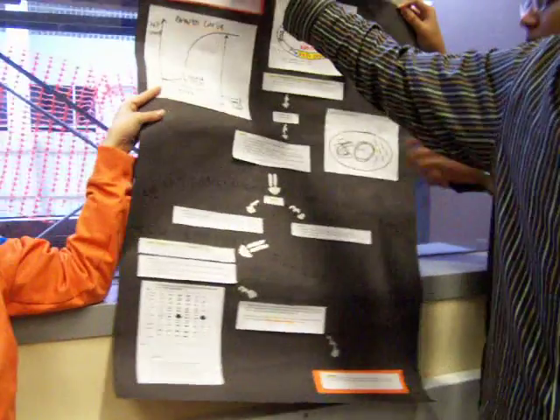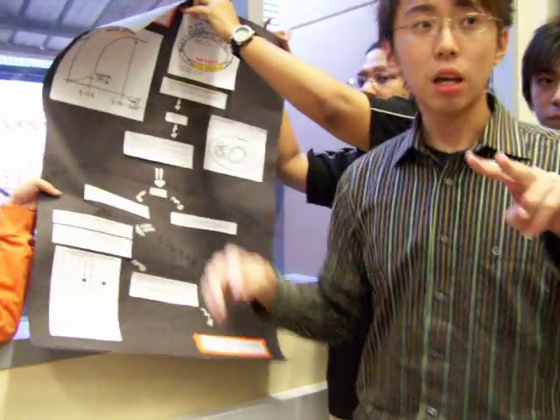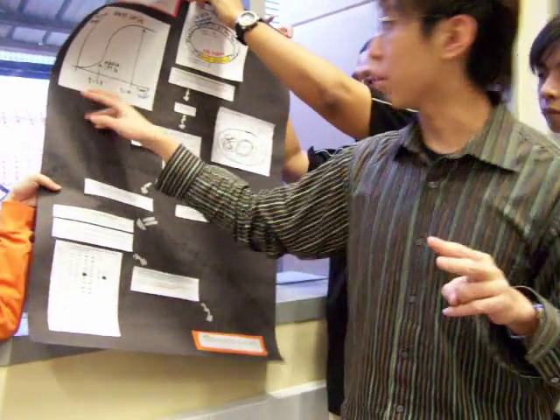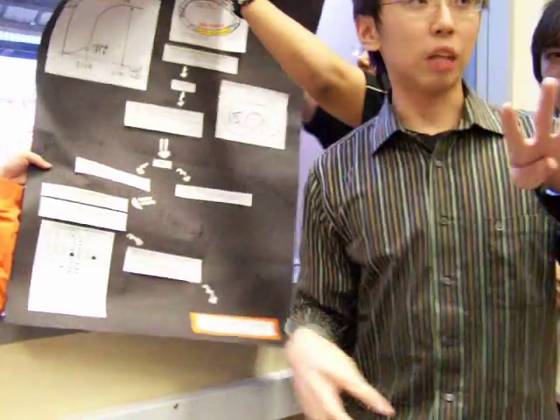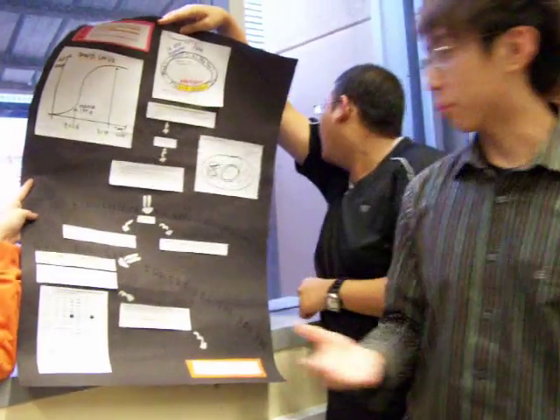I just explain it. Actually, you see this SDS-PAGE? Look at these 4 lanes. As explained just now, we have 4 samples. One is the experiment sample at time equals 2.5 and time equals 10, so 2 samples, and the control experiment at time equals 2.5 and time equals 10. So in total there will be 4 samples. The control experiment will be without the IPTG, which is also the inducer. That means there is no protein produced.